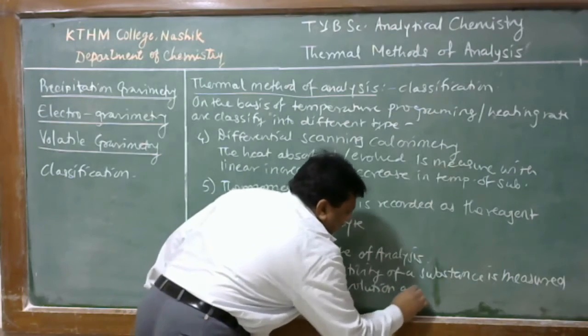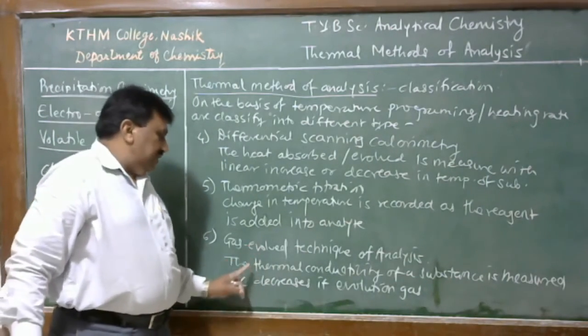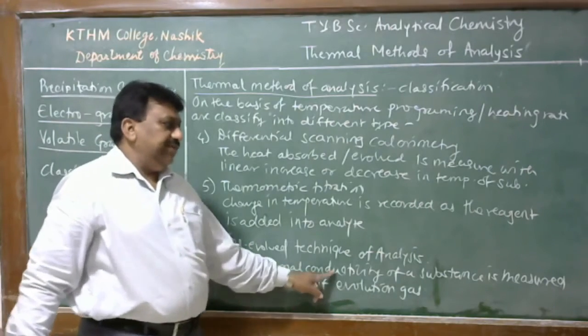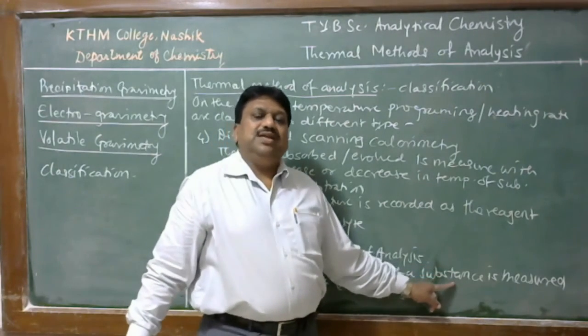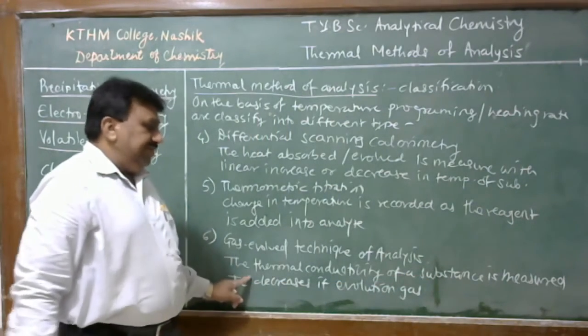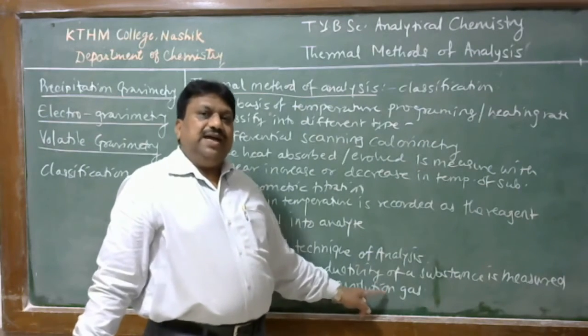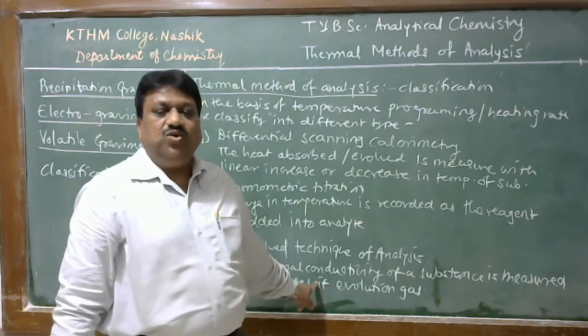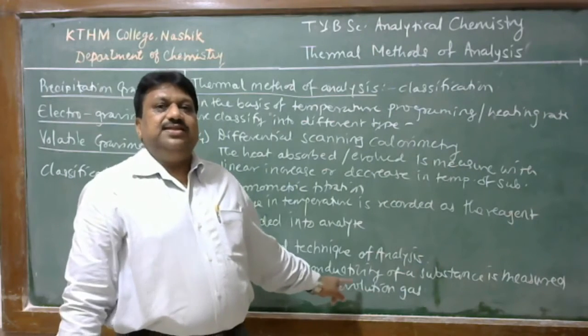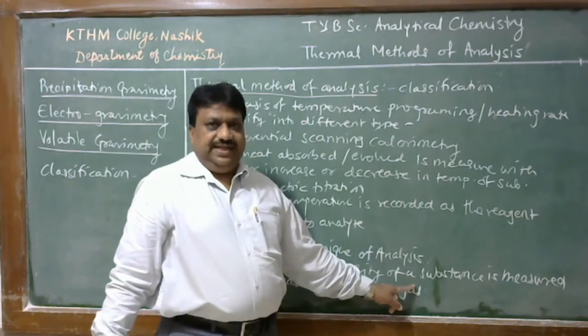Therefore, the gas evolved technique is related with determination of thermal conductivity of a substance by using a thermal conductivity cell. In this case, the thermal conductivity of a solid is more than that of gases, and if the substance undergoes decomposition and there is evolution of gas, then its thermal conductivity decreases.